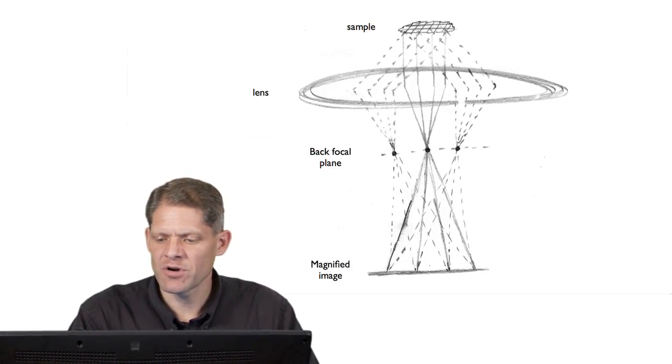Now, in electron microscopy, the situation is different because unlike X-rays, electrons can be focused. And so we gain an advantage by putting a lens behind the sample and refocus all of the scattering that emerges from the sample. So let's think about that in more detail.